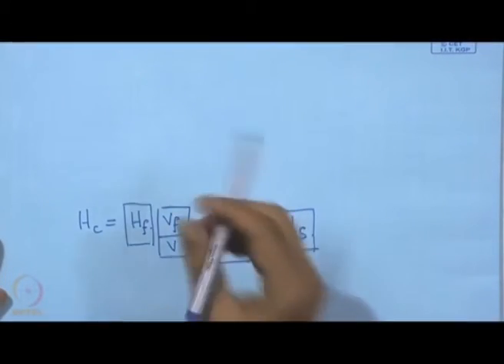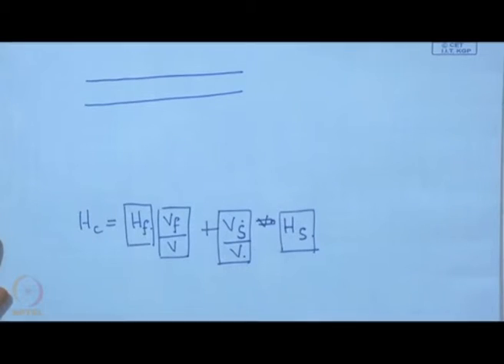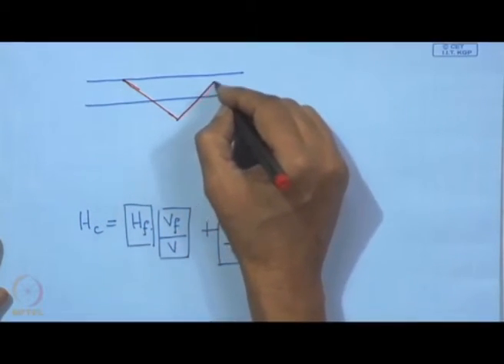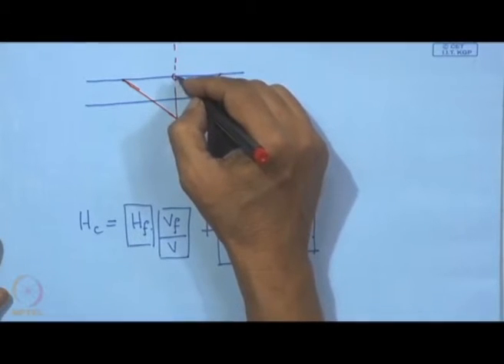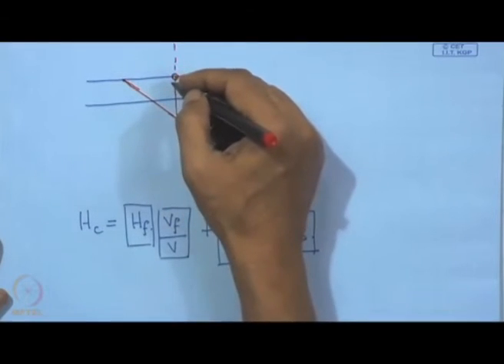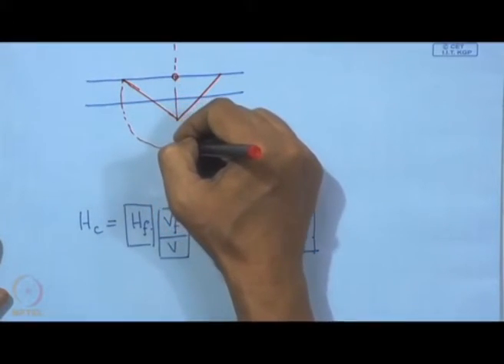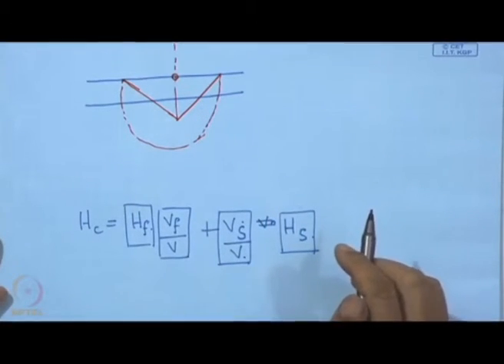Now, this is just illustrated here. So, if we consider this as the area of indentation, then just by considering this as the center and considering half of this diagonal as the radius of the hemisphere, we can consider one hemisphere like this, and in here we can make an apportionment.